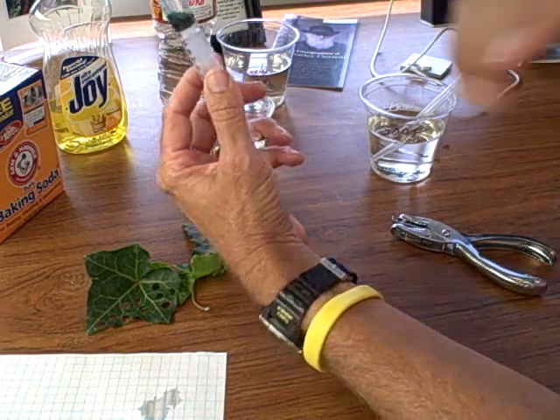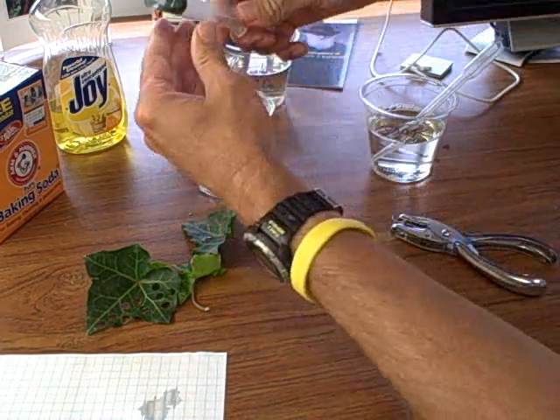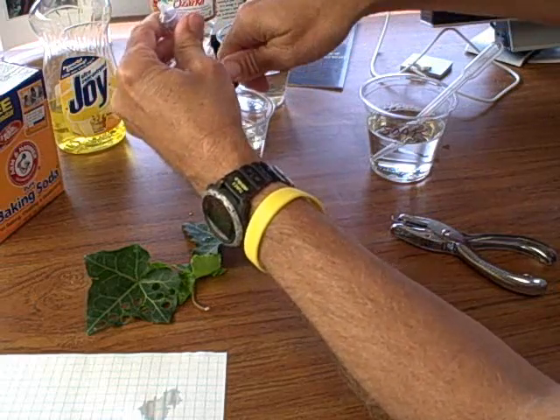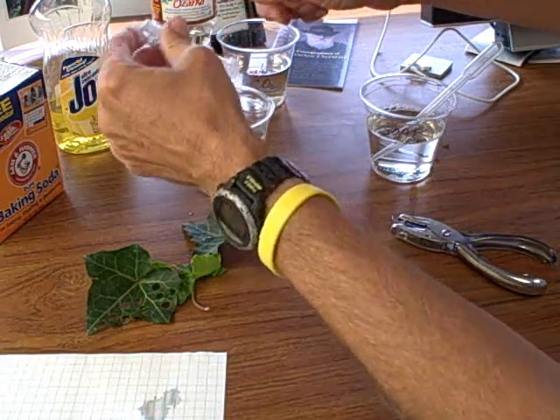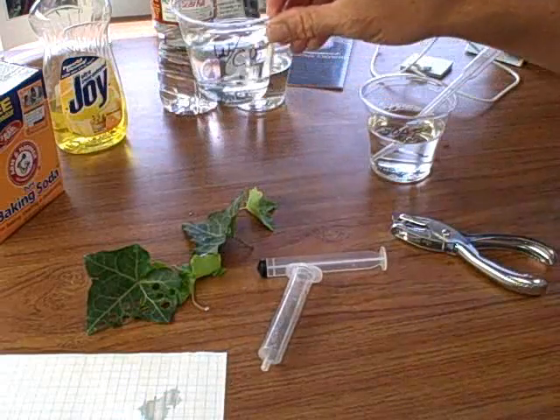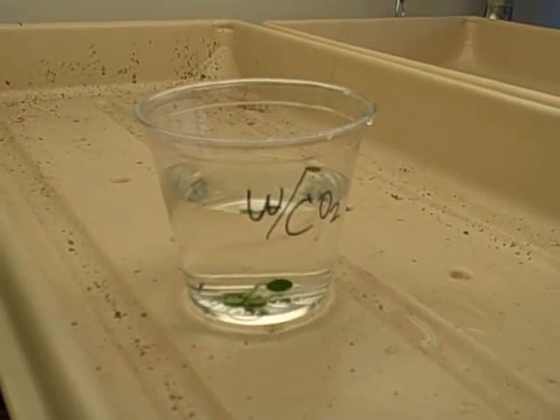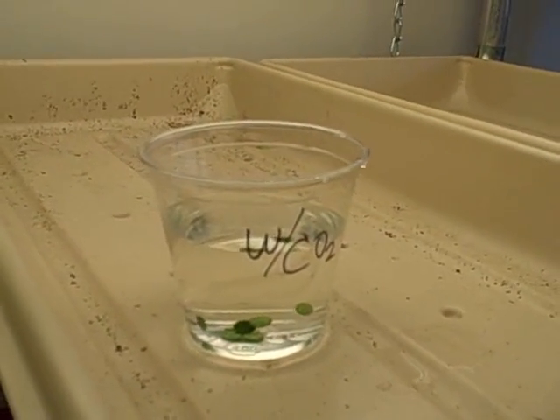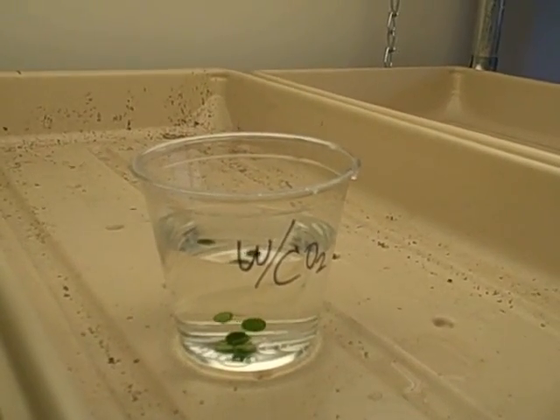This one's ready to go. I dump them out and they're all in there. Now I place it underneath the light. We're at six and a half minutes and I just swirled it a minute ago.